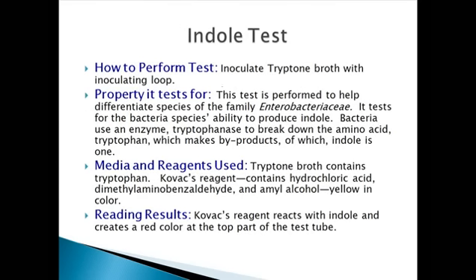So now let's talk about some sets of confirmative tests, which are going to make us confirm whether we are having fecal coliforms or not. Because remember, a false positive will be really bad, and a false negative will be much worse than that. That's why you need to go through very many steps and reactions to finally confirm whether we have any water contamination with fecal coliforms or not.